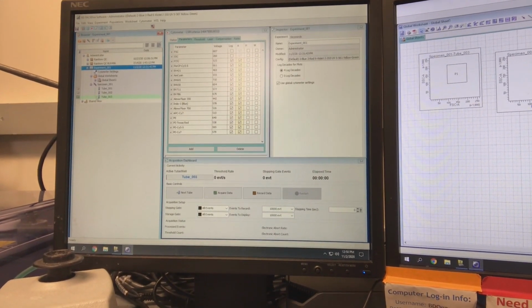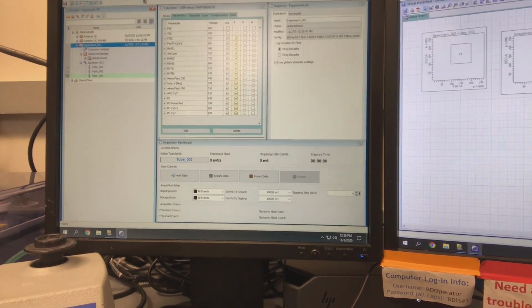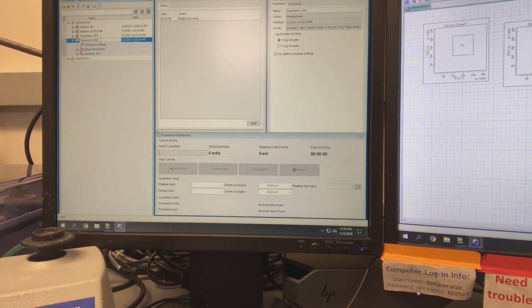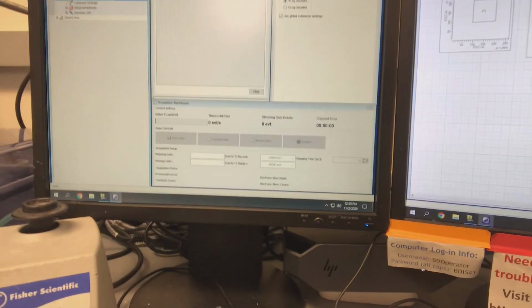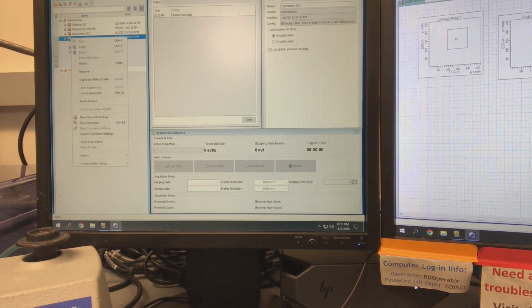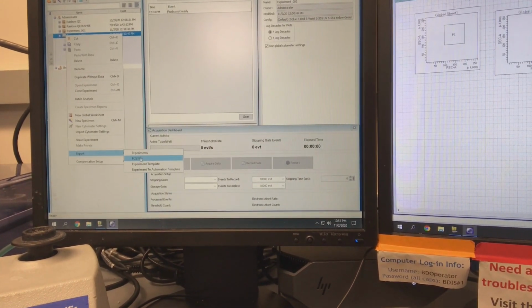So if you've just created your experiment and recorded all of your files, your samples, and you want to keep that to use at a future date, please right-click the experiment, duplicate without data, and then rename this new experiment without data your template. That way, you can always access the original document just without the data, and you can import and export that as necessary. When you right-click, again, on that experiment, you can export as an experiment and FCS files. You will want to do this both.